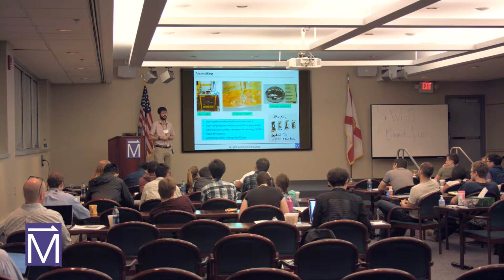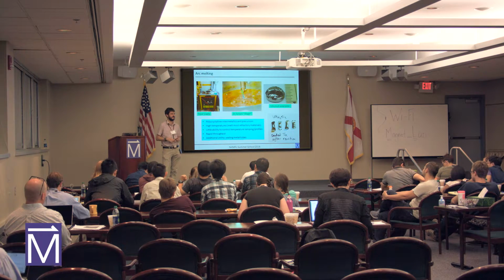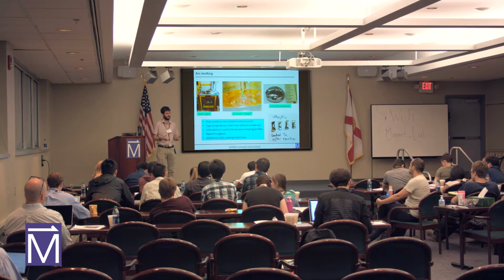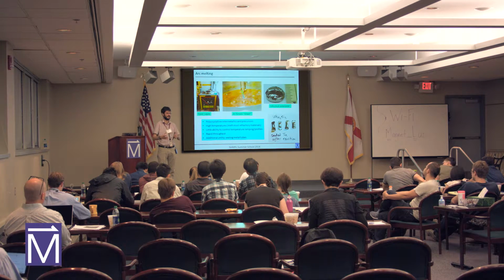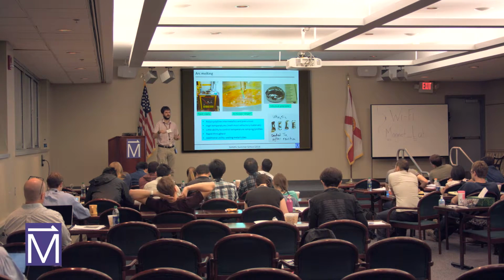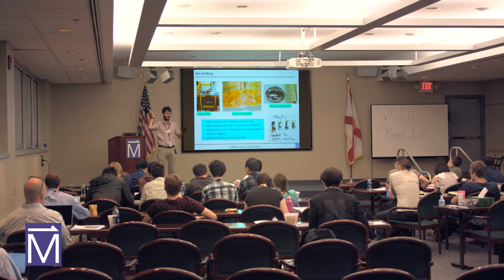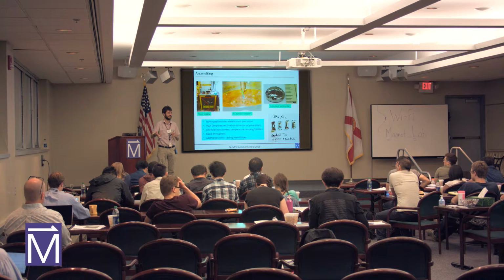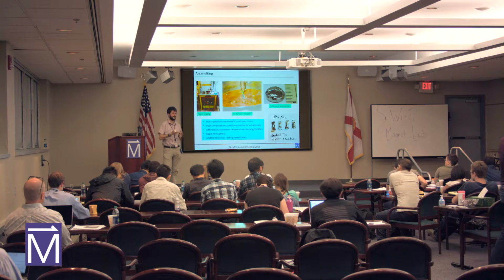I don't know if that would be so helpful, to be honest, because when you grind and press, the idea, at least what I'm thinking of when I do that, is to reduce the amount of inhomogeneity. The only way I think you can do that is, let's say you have a piece of material that's 90% one thing and 10% something else, but that 10% is just distributed all around. When you ball mill it, you break up those pieces and distribute them more finely. What you're hoping for is that they're going to encounter the other non-reacted stuff, right? So let's say you started with YBCO, and you started with yttrium oxide, barium oxide, and copper oxide.